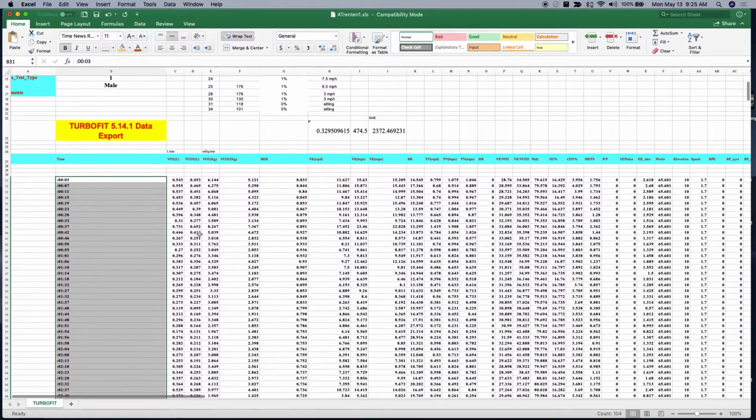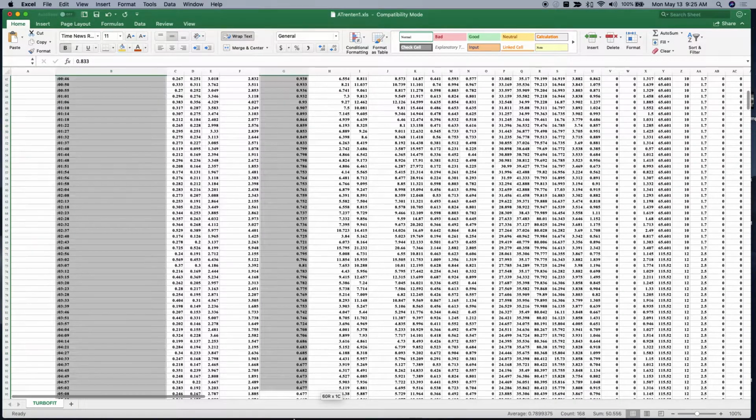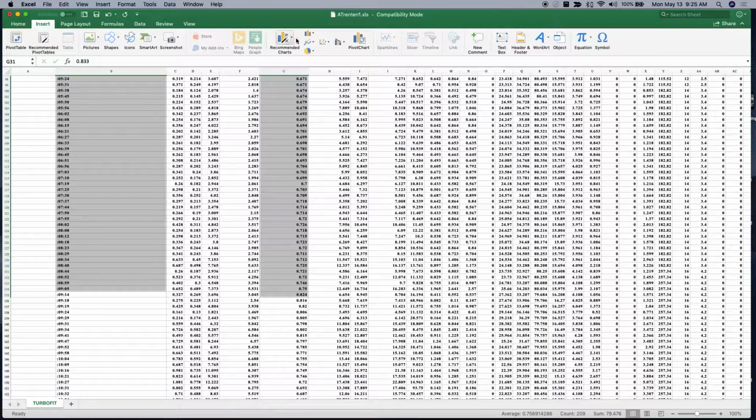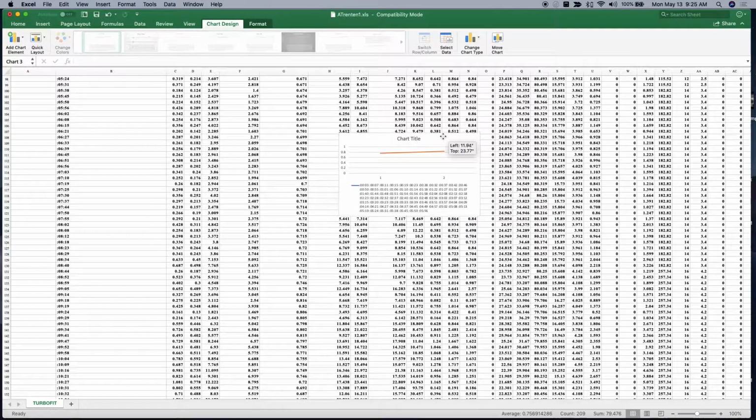If we want to graph the RER over the sitting stage or over the whole time period, we would highlight a section over here, and then you hold down the control button, and that's how you highlight the Y column. So now we have the X column highlighted and the Y column highlighted, so you can do it without the columns being right next to each other. And you can just click Insert, Line Graph, 2D Line Graph.